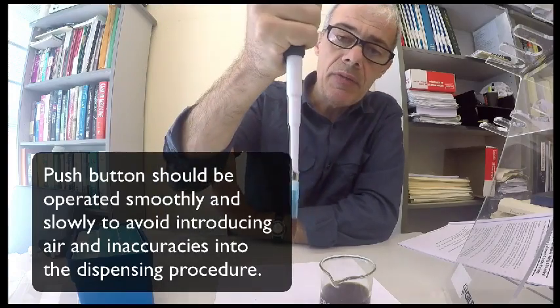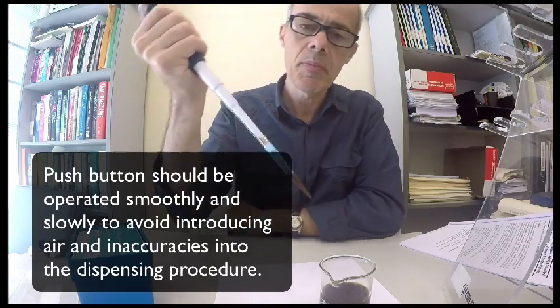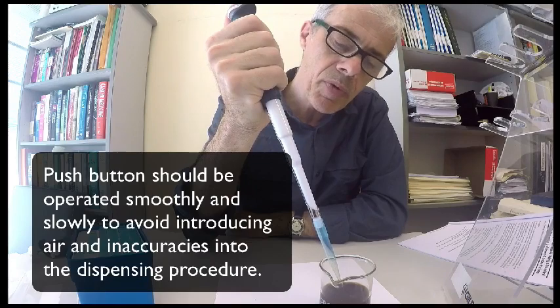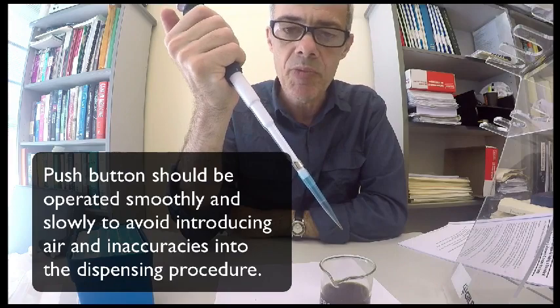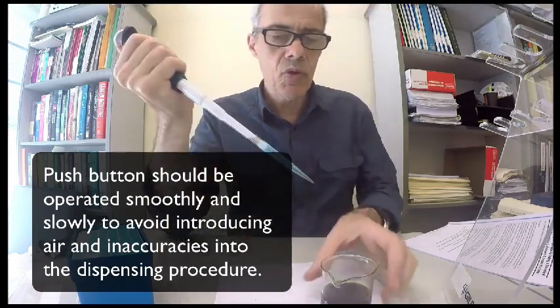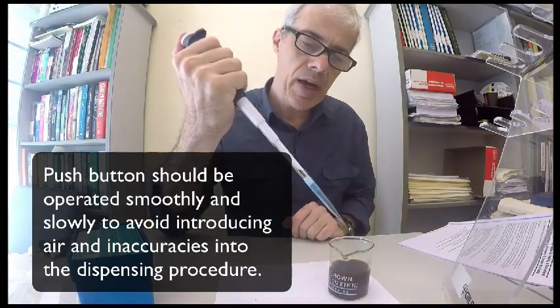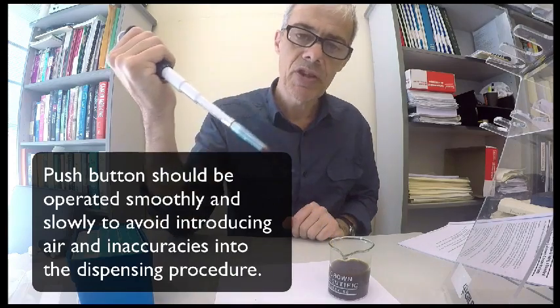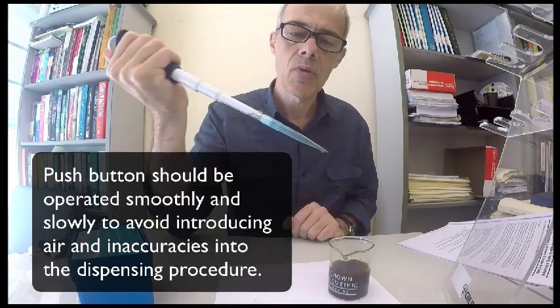Keep the pipette in the vertical orientation to avoid the solution running up into the pipette. To dispense, you go back down to the calibrated stop and then just down to blow out that extra bit of air, put a bit more pressure on it. Okay? So again, to draw up the solution, it's simply a matter of going down to the first stop and then immersing, then drawing up, then transferring to where you want to transfer, and then going all the way down.